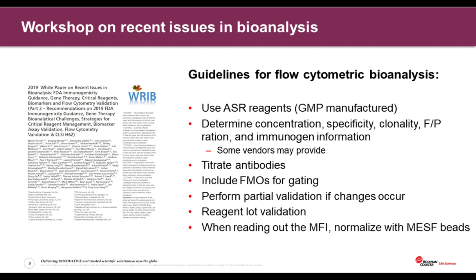Inclusion of FMOs for gating. This isn't an issue when we have beautifully separated, distinct populations where you can discern positive from negative. But especially in the case of cellular therapies, where the antigen of interest has a modular effect and we can't necessarily discern a positive from a negative, it's important to include FMOs so that we can utilize them for gating, but not just for gating, also for compensation matrix validation.